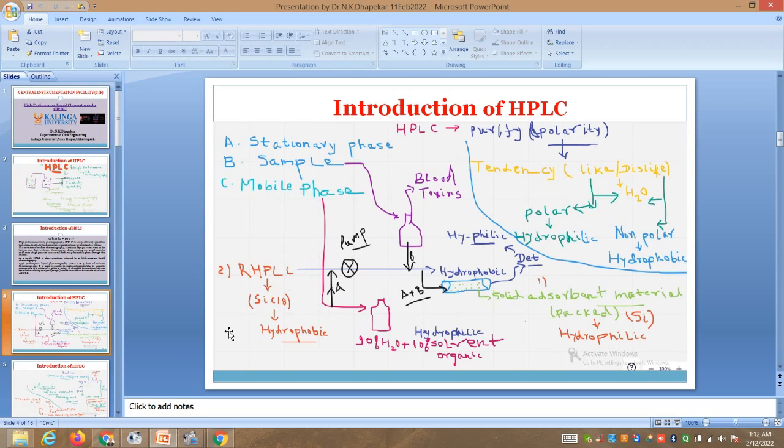So, I am going to discuss the application of HPLC in civil engineering. Chemistry is not my concern, but how chemical admixtures can be studied, and the quantification of the compound which plays a major role in altering the properties of concrete, that is possible with HPLC, and that I want to show here. So this is the tube, the stationary phase, silica, mostly used in a packed manner, and it acts as a hydrophilic.